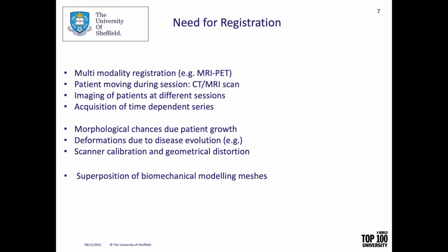It's also possible that you do a time variant analysis. It means that you acquire images at different time steps. When you do that, there could be movement inside the image, so you don't have good information if you don't register, if you don't overlap correctly the two images.